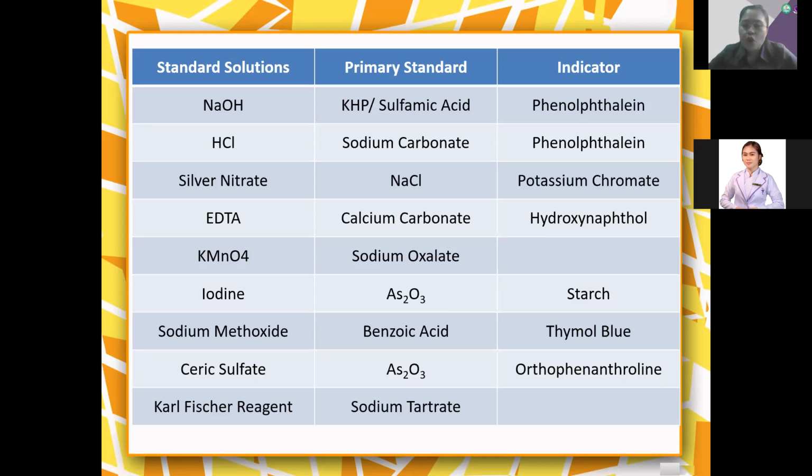Pag sinabing hygroscopic, these are substances that absorb moisture from the environment. Meron tayong water vapor, di ba? If si sodium hydroxide pellets, you just left it in a table without closure, magliliquify yan siya after a period of time. Kasi again, kinukuha niyo yung water vapor sa environment and madadagdag yun sa kanya. And that will change the concentration of the sodium hydroxide. So that is the reason why we always do titration with the sodium hydroxide in the laboratory for us to make sure na ano ba talaga ang correct niya na concentration.